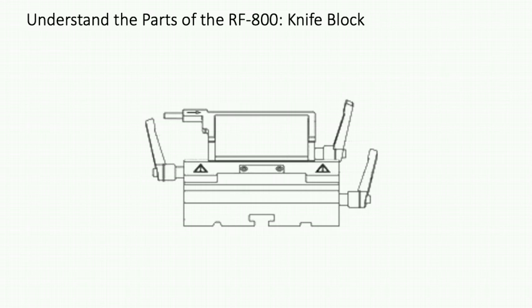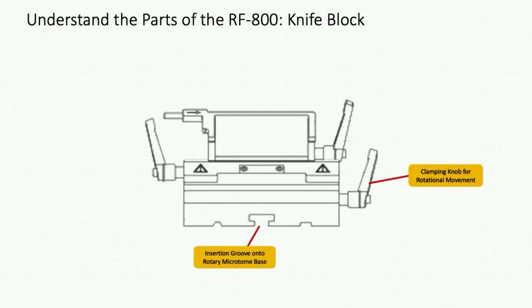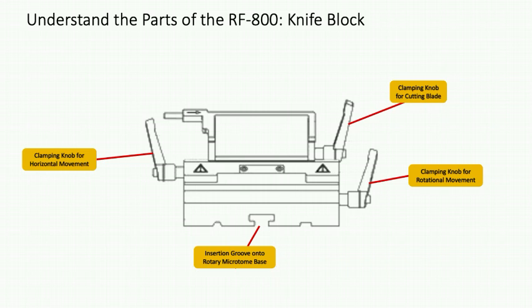Next, let's understand the parts of the knife block. On the bottom of the knife block, there are 3 small grooves that allow you to insert the knife block onto the microtome base and secure it in place. On the right side, there are 2 levers. The bottom right lever is the clamping knob that controls rotational movement of the knife block. This allows you to adjust the cutting angle. The left clamping knob controls the top component of the knife block, which is the cutting stage. It allows for horizontal or lateral movement of the cutting stage. The right upper lever is the clamping knob for securing the cutting blade.